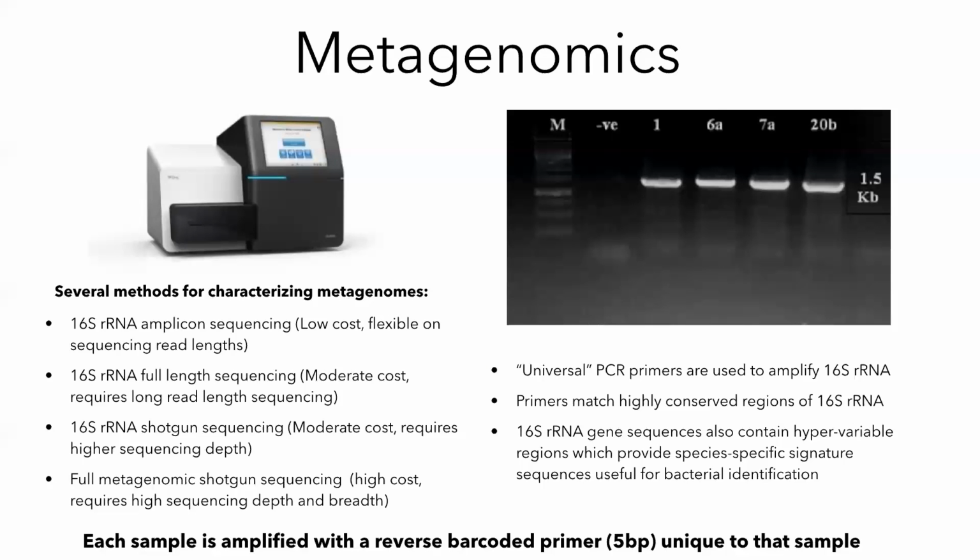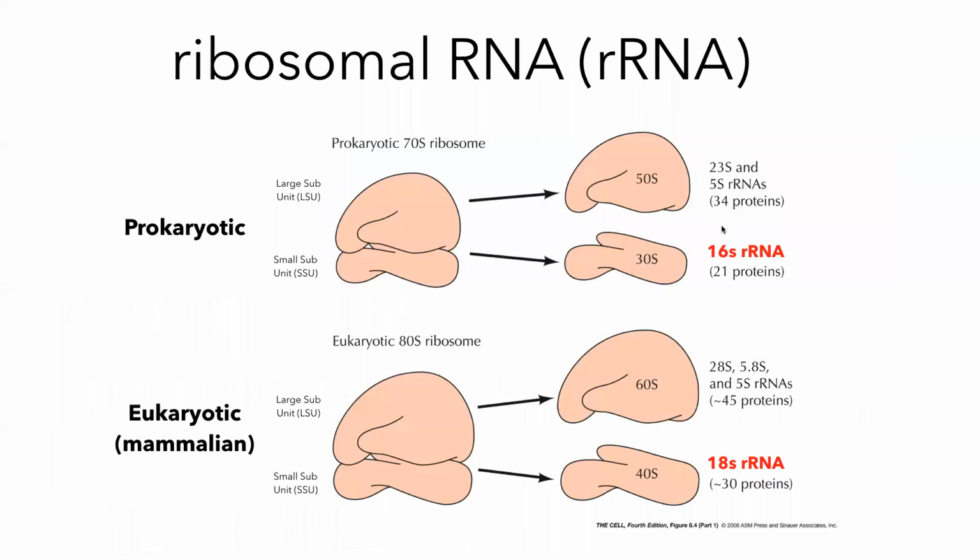But not only that, we also have primers that could help us detect just the 16S sample. And so you can see right here, this is that 1500 base segment that could be amplified with PCR. But also we can actually look for some specific regions and only look at that region, and that will help us detect the taxonomy of our sample in general. So we'll talk about that in detail here in a second.